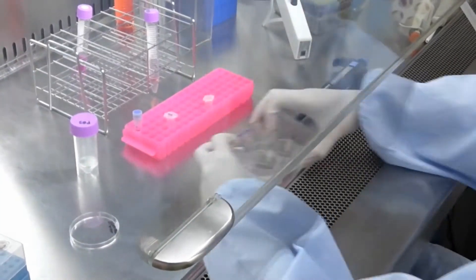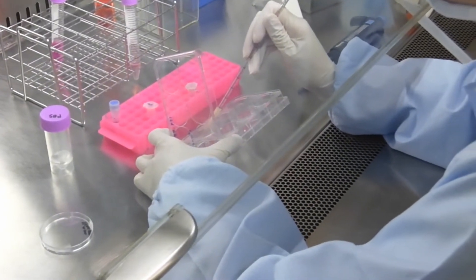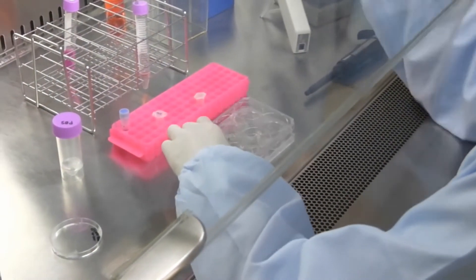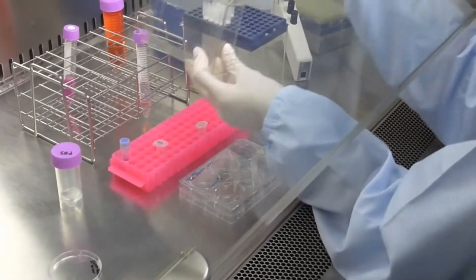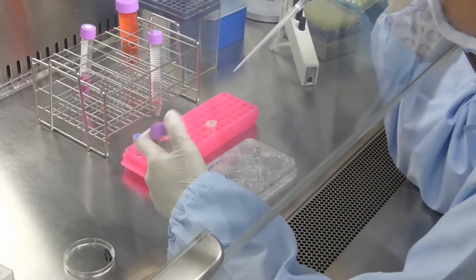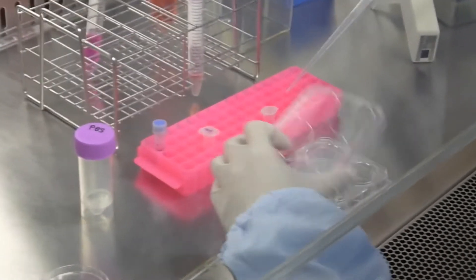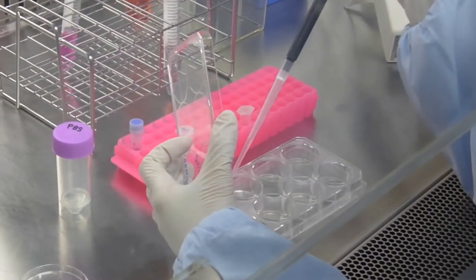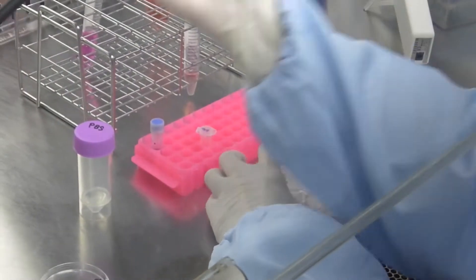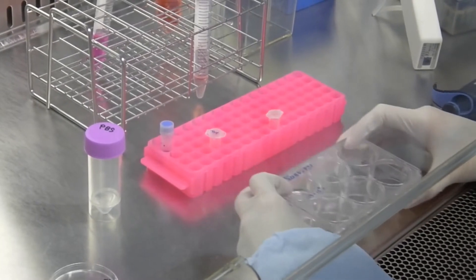After incubation, transfer the 6-well plate to a safety cabinet and aspirate the 50% TrypLE Select solution. Then wash the well surface with 2 mL of PBS and remove the PBS with an aspirator. PBS should be added gently, since iPS cells are easily detached.